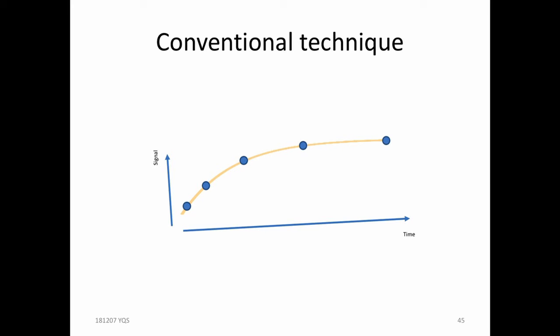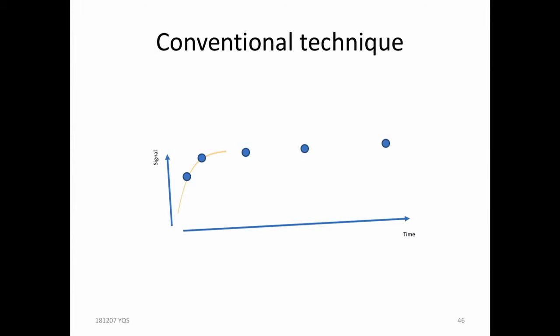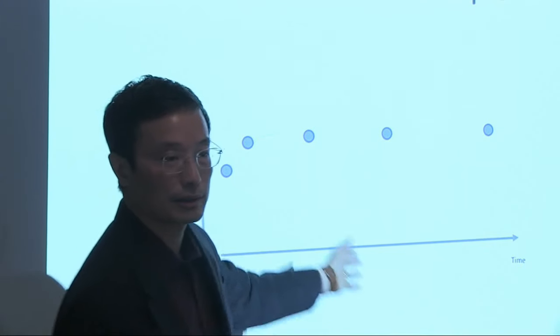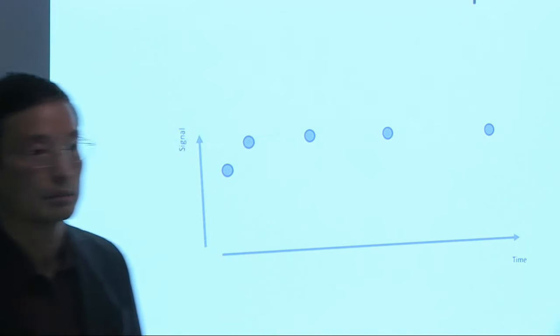Again, through some simple examples. Let's say we were talking about the T1 relaxation, right? We say the signal should recover like that. If you measure a few points, well, that's good, right? You measure that process. But that's when the sample happened to relax like that. If you use the same protocol, but the sample relaxes very quickly, well, only these two data will give you something useful, and then the others are already saturated. It doesn't tell you anything about the material.